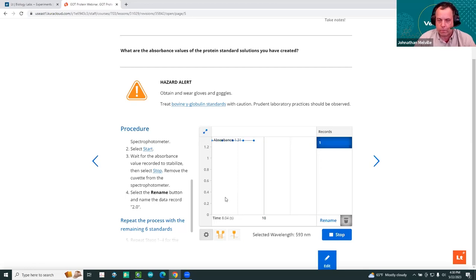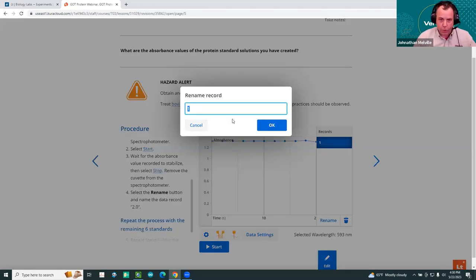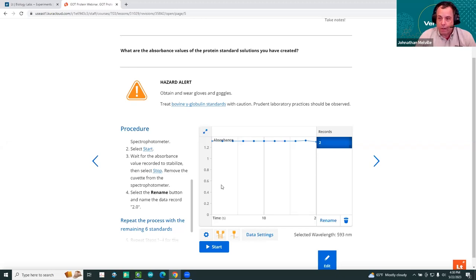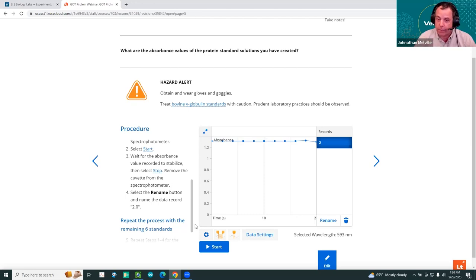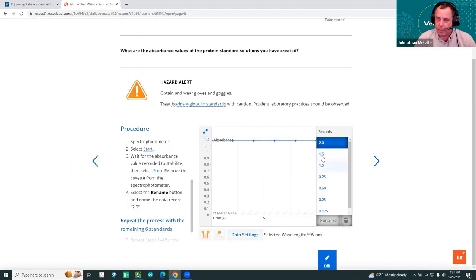Damon confirms that 595 nm is what the literature says, and indeed that's where our peak landed — so I'll hit Continue. The instructions for what to do next are listed in LT. On the next page students do their standard curve data collection. Here I'll demonstrate with the 2.0 mg/mL protein sample — the instructions say to obtain the cuvette labeled 2.0, gently invert twice, wipe the outside, select Start, wait for the absorbance to stabilize, then select Stop. That usually takes about 10–20 seconds.